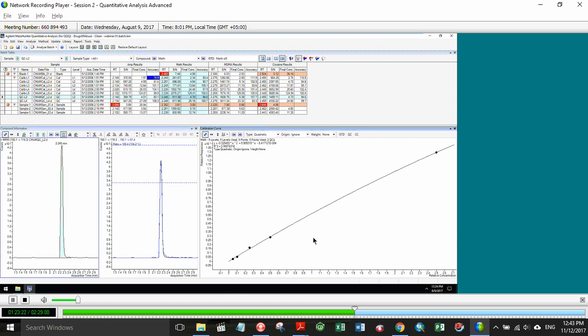Okay, I have a question here. The curve fit assistant can be unwieldy sometimes because it displays types of curve fits that I know I don't want to use. Can I exclude certain types by default so they don't clutter up the list of curves? The answer to that is no.